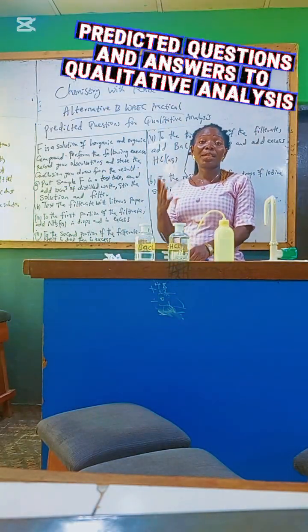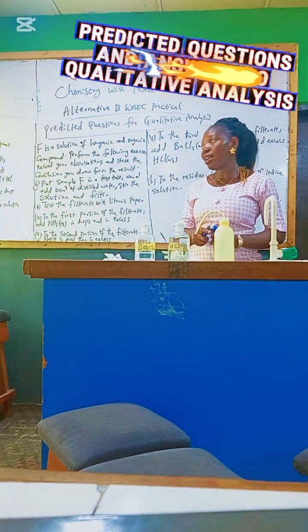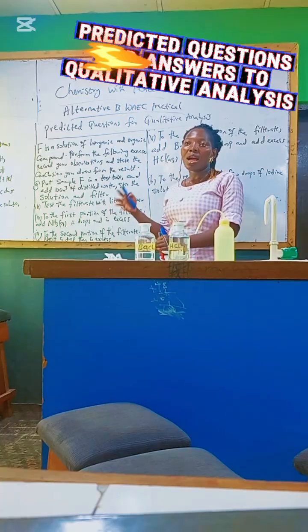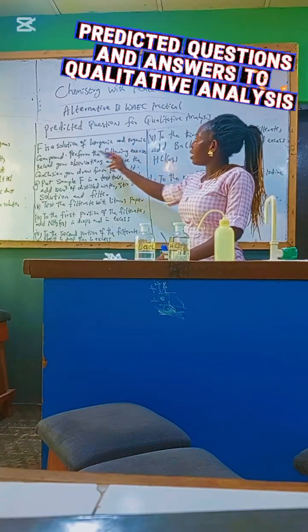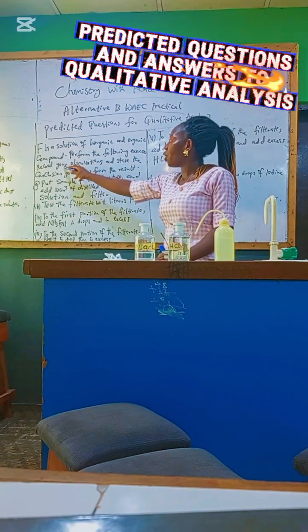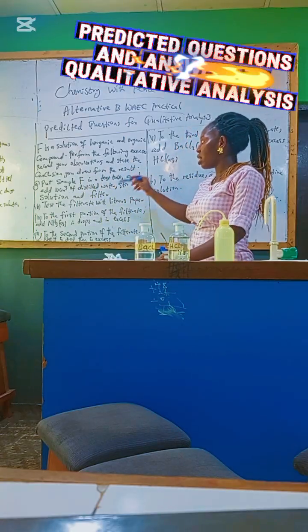Still in preparation for Alternative B 2026 WAEC Practical, here are my predicted questions, and then we are going to answer them. F is a solution of inorganic and organic compound. Perform the following exercises, record the observations, and state the conclusion you draw from the results.